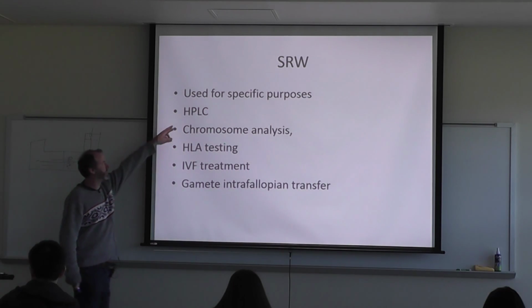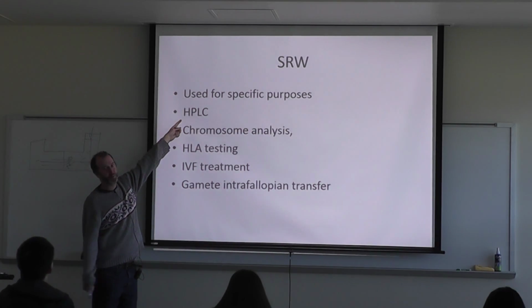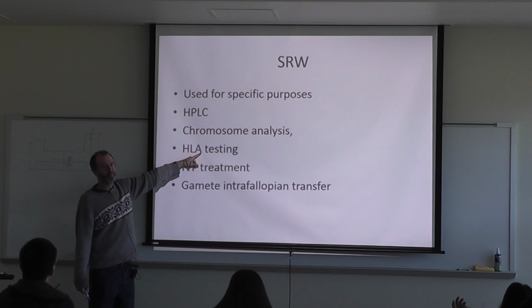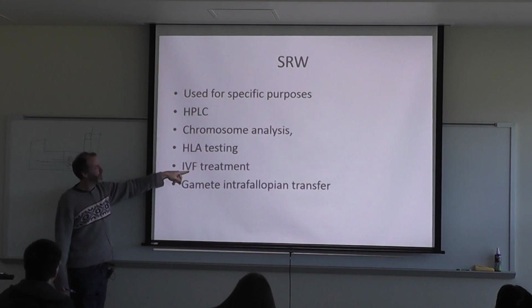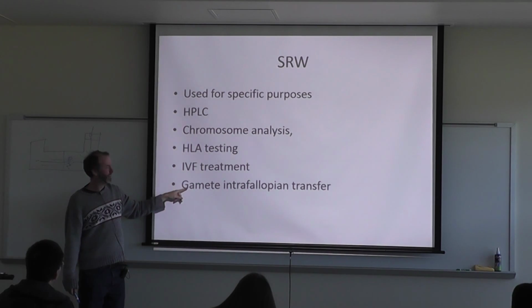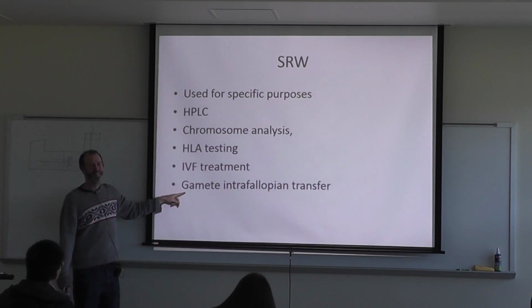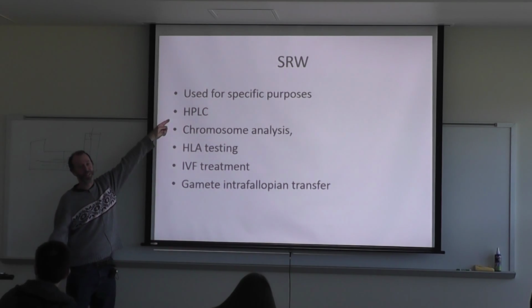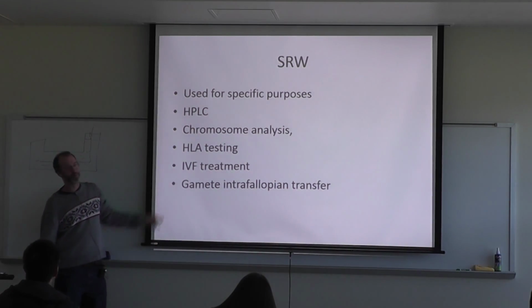Like I said, it was used for specific purposes. I said HPLC is one of them. Chromosome analysis. HLA testing, what's that? Oh, you guys are in hematology now, right? Yeah. What IVF treatment? That's in vitro fertilization. Gamete intrafallopian transfer. I know that's for the eggs. Yeah. So those are special reagent waters you'll see that are specifically for these purposes.